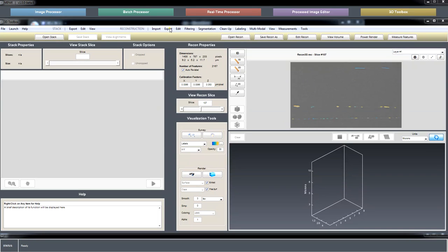I think I used Autodesk products to make a volume mesh. I think their CFD simulation software can take a surface mesh and make a volume out of it, and then put it into. And I know Simpleware is another solution. They're all about meshing 3D data sets. But yeah, hopefully we can at least help you segment the features so there's something to make a mesh out of.